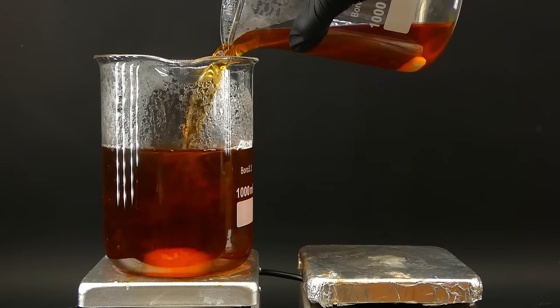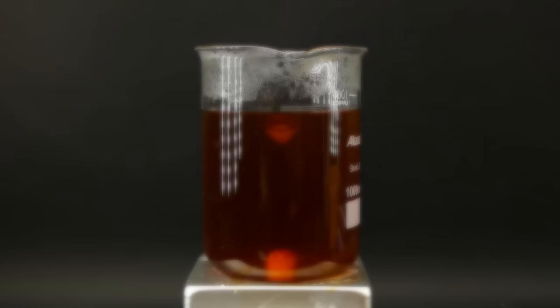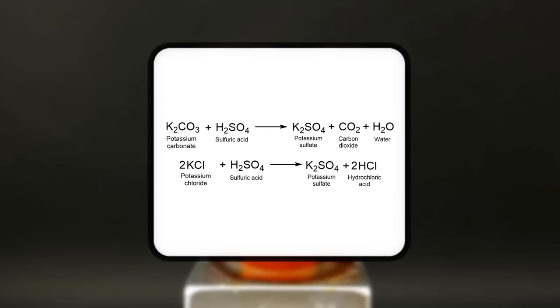And now I have to boil it down to concentrate the potash. After a few hours about half of the water evaporated. So I got everything into a single beaker and continued boiling it down. Now to make the potassium sulfate I will have to acidify this solution with some sulfuric acid.